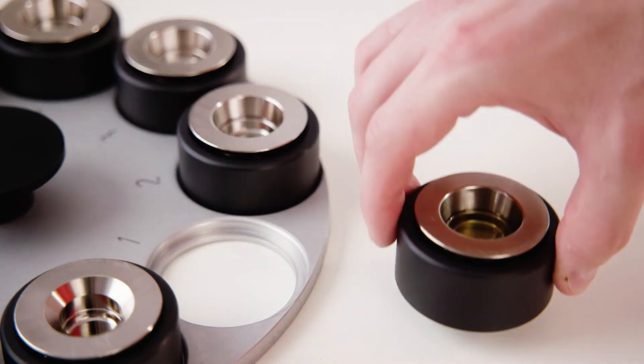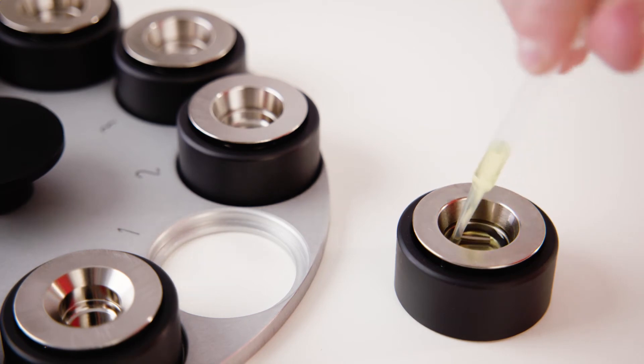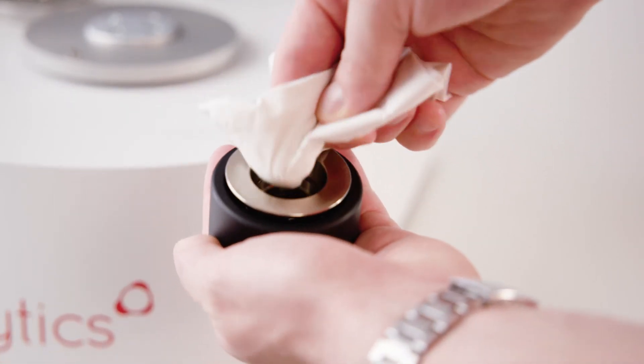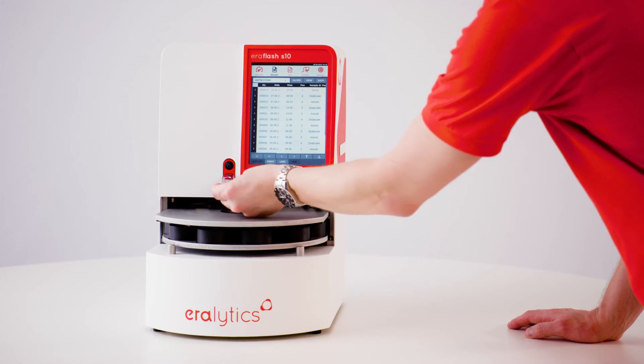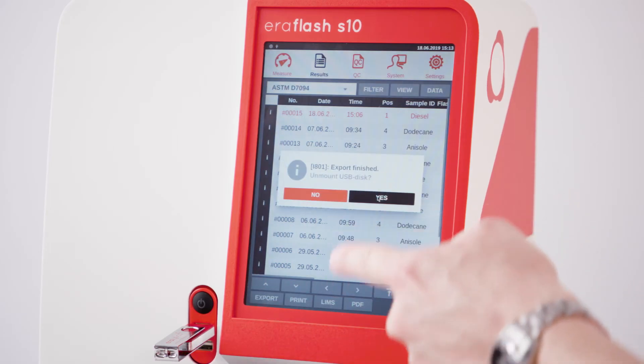As a follow-up, remove the cooled cup from the carousel. Empty it and wipe it with a tissue. The results are stored in the internal memory and can be conveniently exported to a USB drive, printed, and transferred to a LIMS.